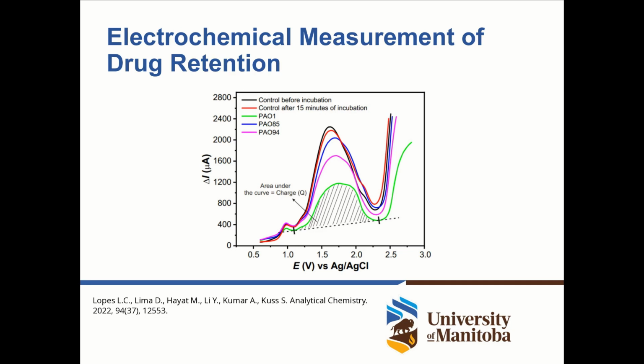So these are bacteria where we know that they are resistant to tobramycin because of efflux pump expression. And you see that the signal is much higher because these organisms are able to feed back this drug into solution. And in blue, we have a mucoid strain of these bacteria, which are even more resistant because they express certain features and fragments that can render them even more resistant.